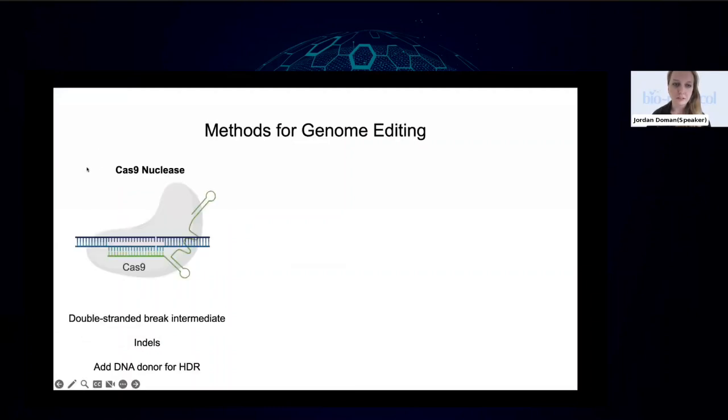So just to dive right in, if you're attending this webinar, you're probably interested in genome editing. And at this point in time, it's a really complete and robust toolbox that we have for genome editing in many different organisms. The first iteration of this and really big breakthrough was Cas9 nuclease. Traditionally, when people use Cas9 nuclease, you're targeting the Cas9 protein to induce a double-stranded DNA break at a target site in cells. And if you just do this, you'll generate indels, or insertions and deletions, at the target locus. And if you add a DNA donor, you can do HDR, or homology-directed repair, to install specific mutations.